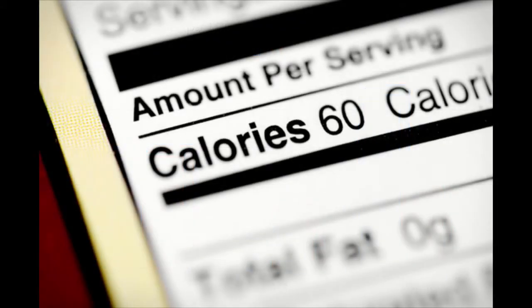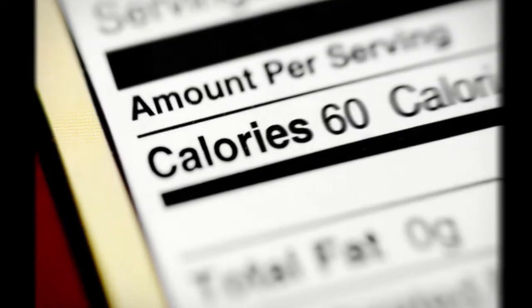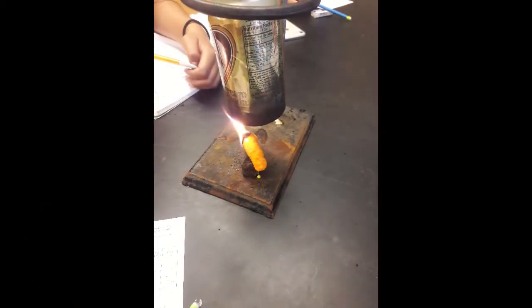The calorie content of the label cannot be accurate because our results were not equivalent to that of the label. Each sample produced different results that depicted the unique energy content and heat energy of that sample. The Cheeto sample proved to be the most dramatic test as it burned the brightest and for the longest time, yet lost the most mass. It also proved to have the greatest calorie content, having 1 kilocalorie per gram.